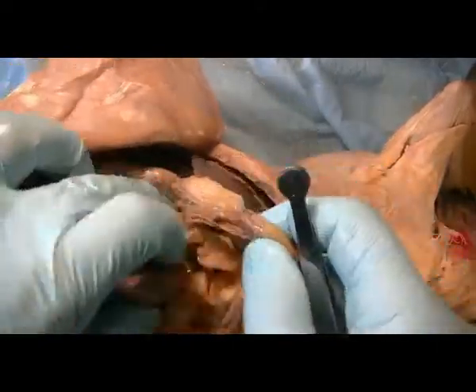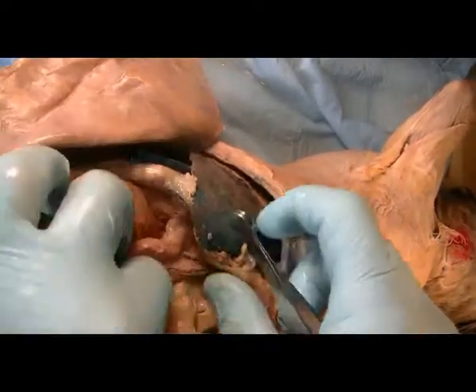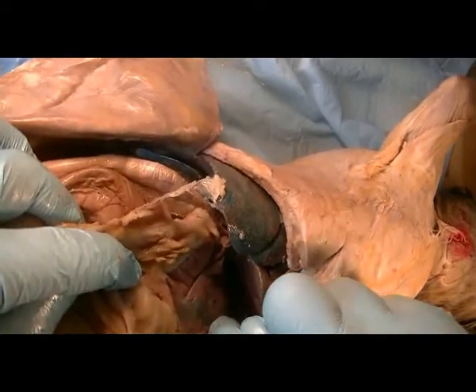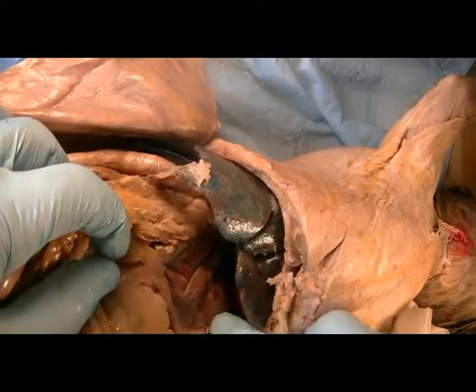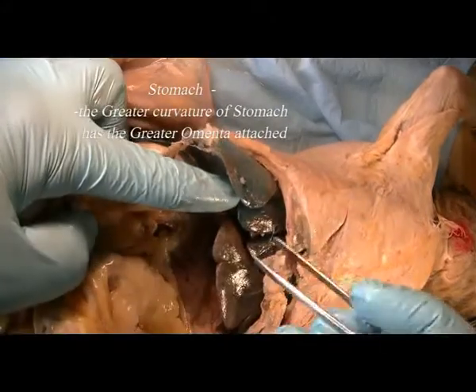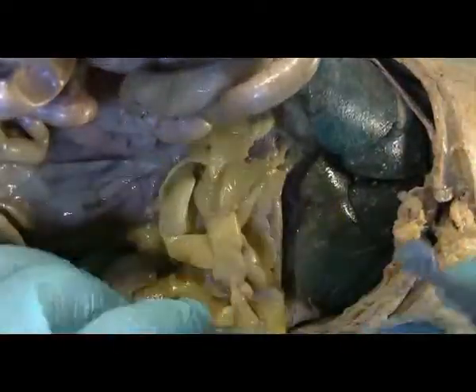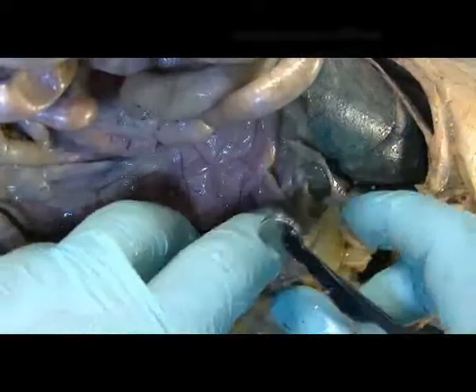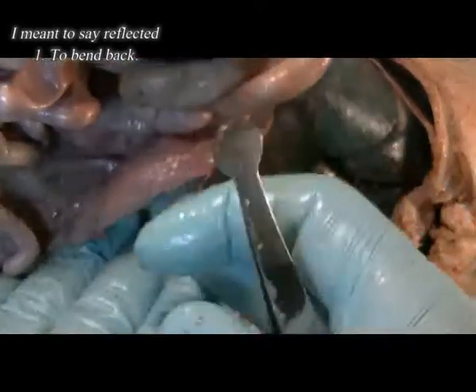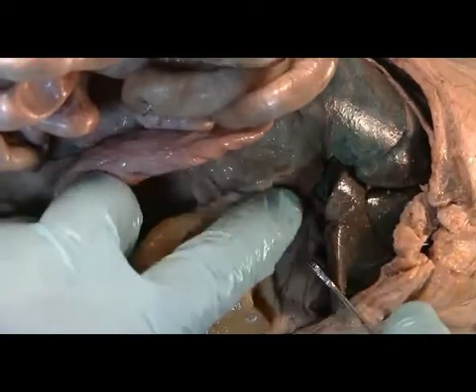And I mentioned that this is the greater omentum, which is attached to the stomach, which, as I move it here, you can see under here is the stomach. Here's the stomach. And as you can see, it's attached to the greater curvature of the stomach. Here's the stomach, greater curvature. Okay, I've retracted the greater omentum so you can see the other organs of the digestive system.